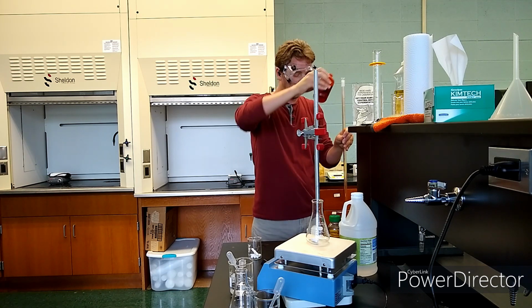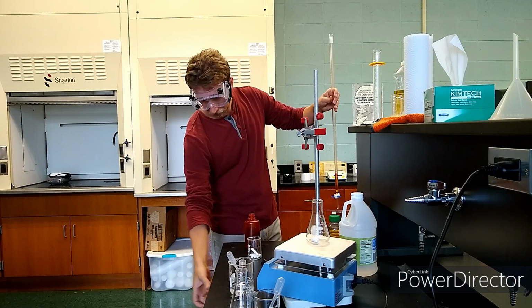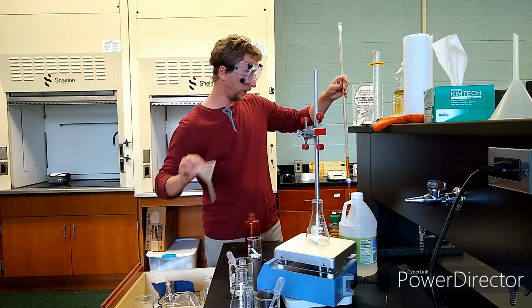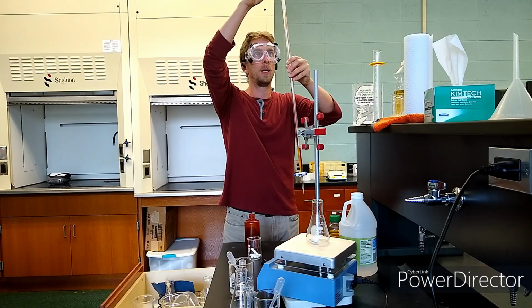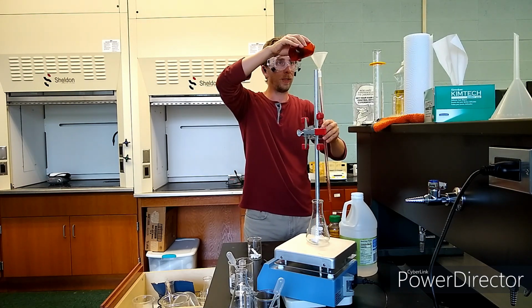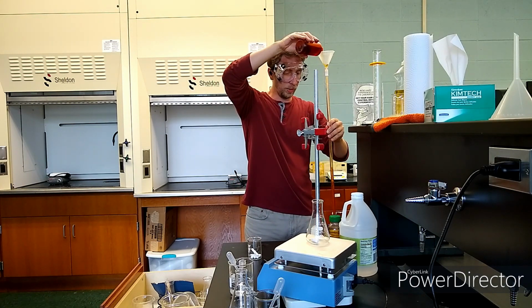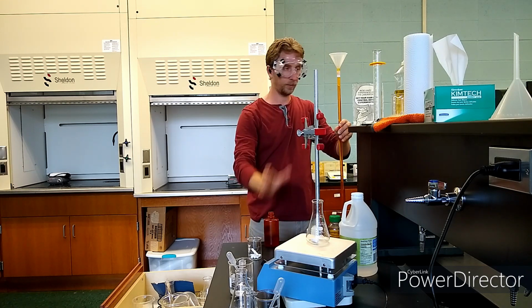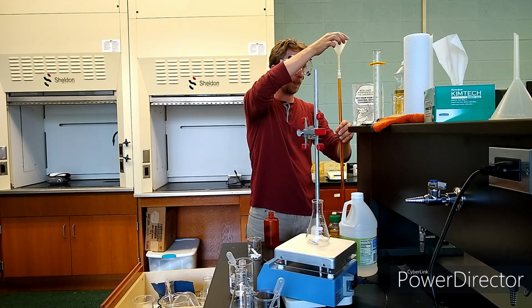Now all I'm going to do next is fill it up. A lot of times I like to have funnels to fill up burettes with. So here's a funnel. I can make it a little bit more convenient. If you're careful though, you don't have to have a funnel. So I'm going to go ahead and use the funnel though, so I don't have to be quite as careful. You just got to be careful though to still go slowly so you don't overflow the burette when you're filling it up. So I'm filling it up, and I like to fill it past the 0 mark. Whoa, that's very full. Okay.